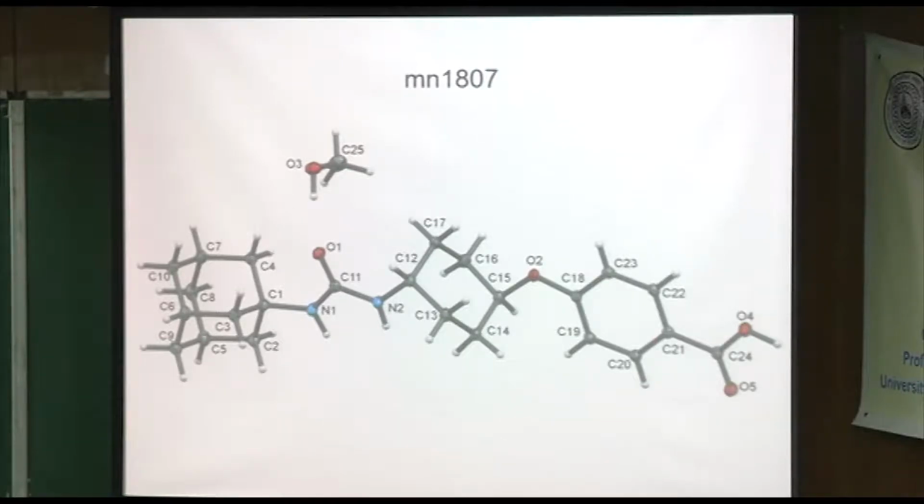Put the hydrogens back. I didn't do a dashed line, but there is a methanol molecule in this one. So there is another hydrogen bond here. It could have been dashed to show that. So this is intermolecular hydrogen bonding. Okay, beautiful. And I think there was also hydrogen bonding across here. I didn't recheck it, but there usually is when you have a carboxylate group like that. You get this sort of carboxylate dimer of hydrogen bonding.